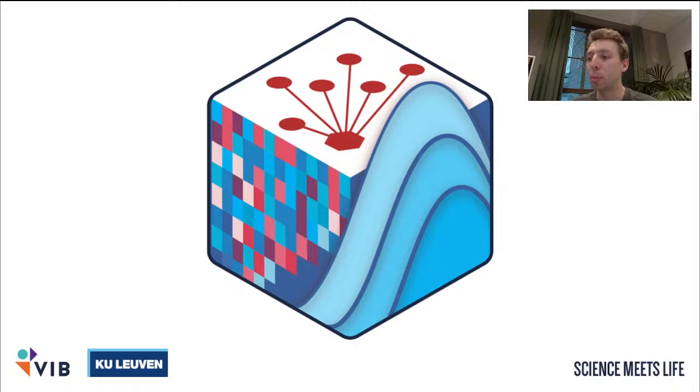And then again, the same person was asking, with SnapATAC, instead of these regions, you get tiles across the whole genome to create your count matrix. This is indeed very inefficient for pycisTopic, because you'll have a huge count matrix. So in this case, I would recommend to use the cell type annotation from SnapATAC to create again the consensus peaks.